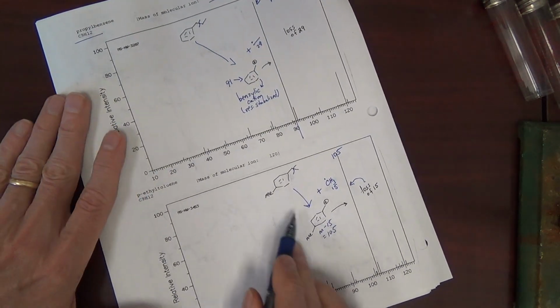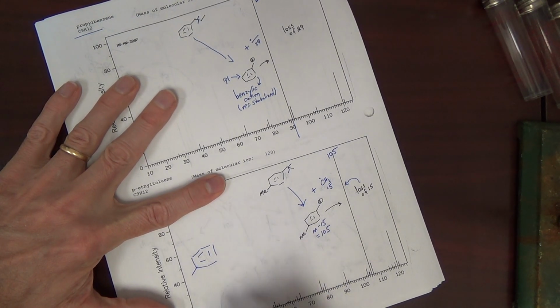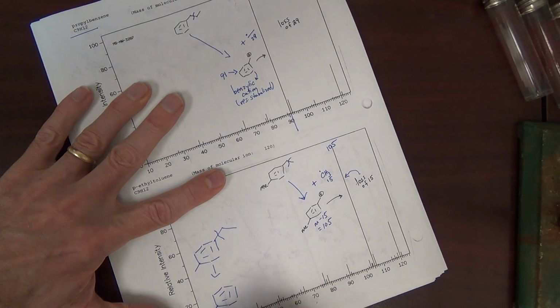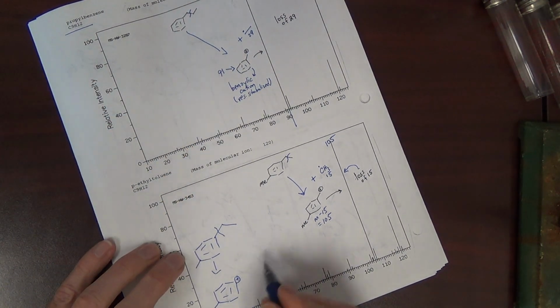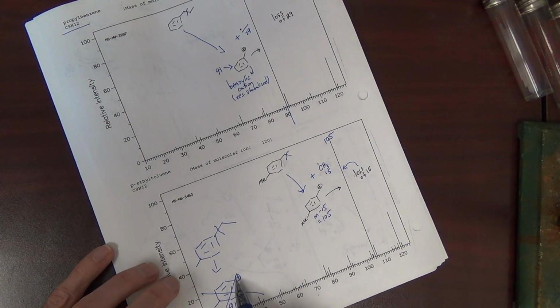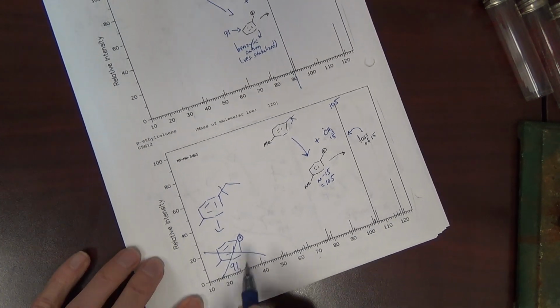The only way for us to get 91 down here is for us to cleave off the ring and to make methyl here. I'll just draw it as a line bond. To make a cation right on the ring. This would be 91. Problem is, this is a very bad cation. Beginning students think that this is resonance stabilized because it's so close to these pi bonds. This cation is not resonance stabilized.